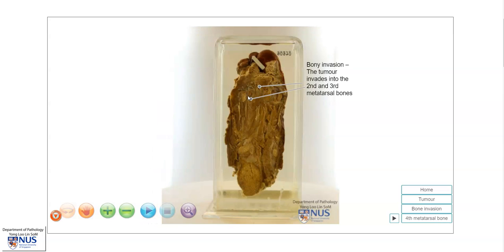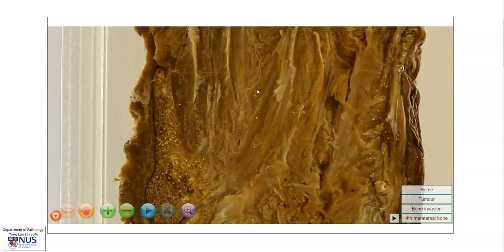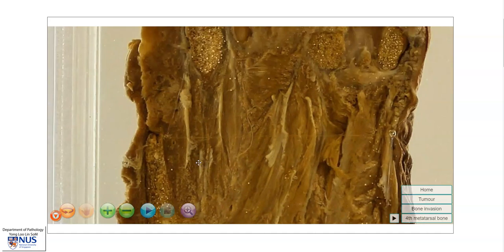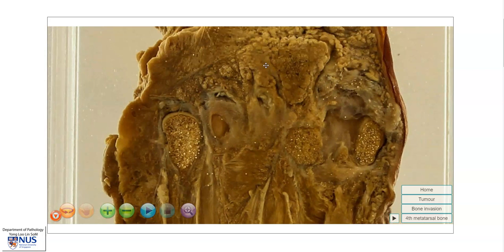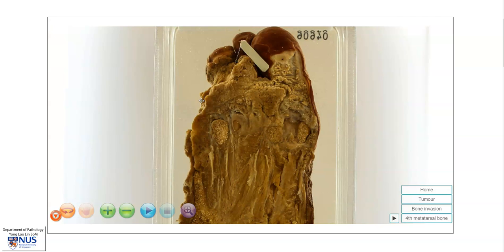As you can see here, the tumour is invading into the second and third metatarsal bones. So this is a very destructive tumour that has actually eroded through and destroyed the lateral two digits of the foot, and is also invading into the metatarsal bones.